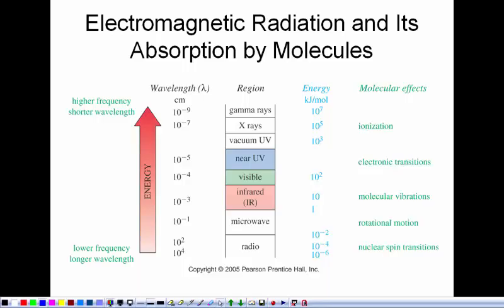Mass spectroscopy, that's an incorrect way of saying it. It's mass spectrometry. And I use the two interchangeably until somebody corrects me, like a mass spectrometrist. Be like, you know, that's wrong. And I'm like, yeah, I know, but why stop a bad habit? So mass spectrometry doesn't use light. It's a different type of technique.